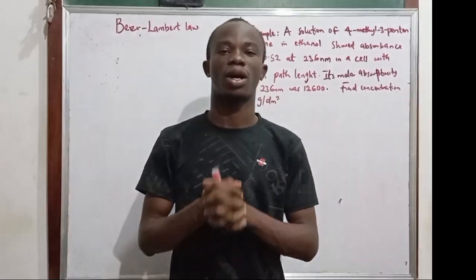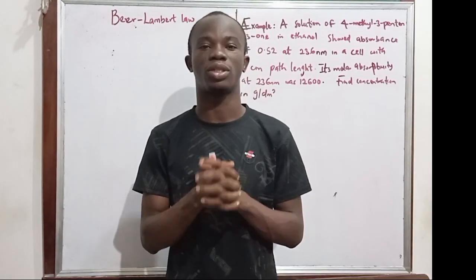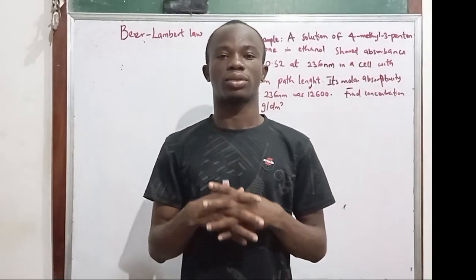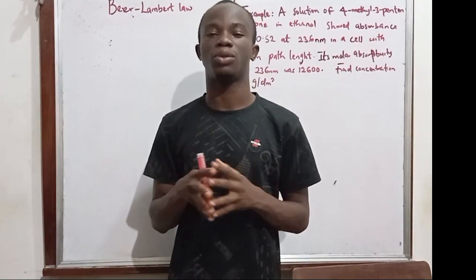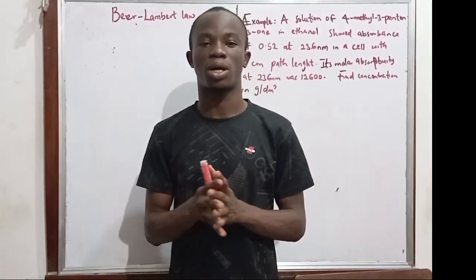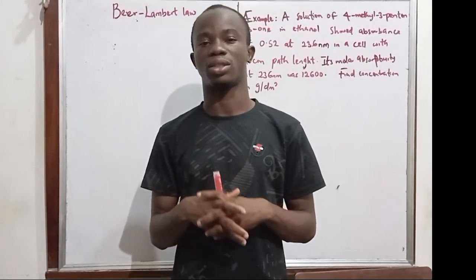In this video, I'll be talking about another aspect that we also need to take note of in spectroscopy. Basically, Beer-Lambert law is a principle that guides spectroscopy, especially when it comes to spectrophotometer, and it relates absorbance to concentration of substance and also to path length.